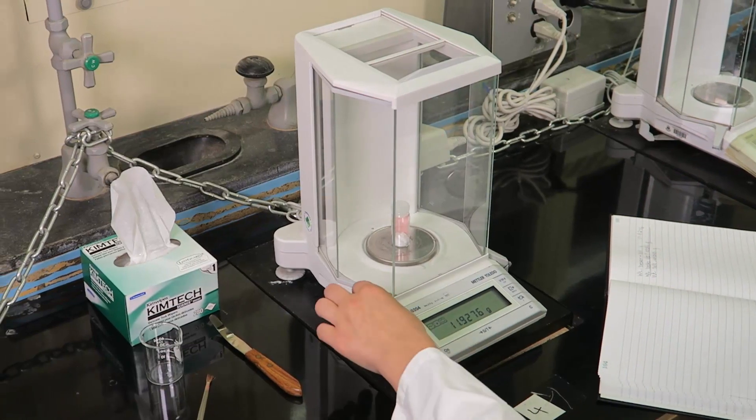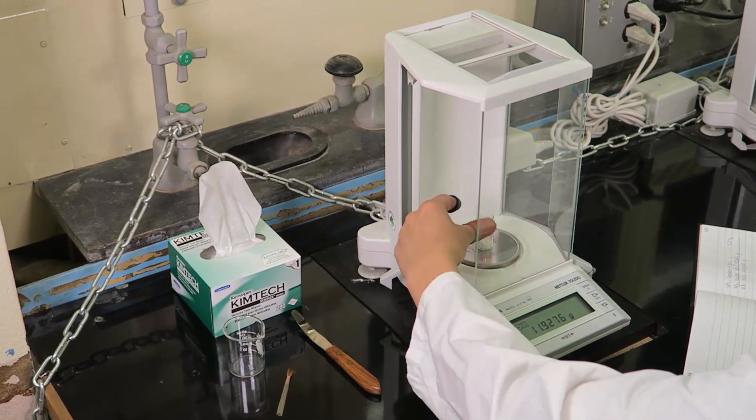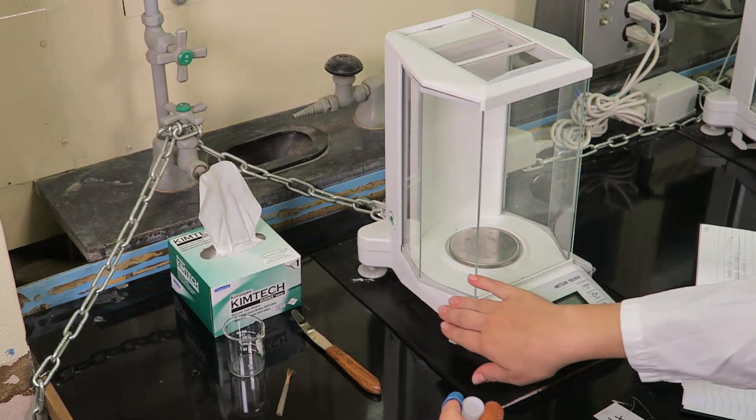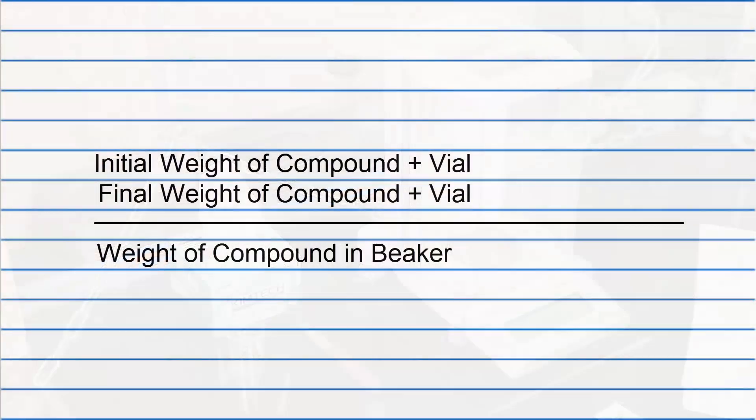Remove the container from the analytical balance and take both the container and beaker to a top loading balance. Be sure to leave the doors to the analytical balance closed whenever it is not being used. Your laboratory notebook should be set up similar to this.